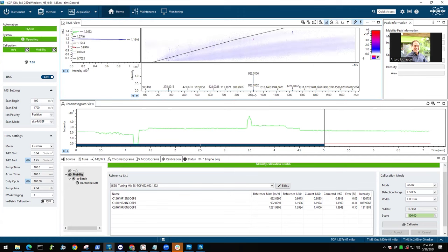With the ion mobility, it is fairly stable, but you see fluctuations based on weather conditions, for example. If you're coming from a high pressure system and you have a storm moving through, atmospheric pressure drops, you also see a drop in your ion mobility. So you have to change the valve positions a little bit to make sure that you're back in the range where you want to be. But it is not that it's completely drifting away. It's minor changes. But that as well, I would see it on a regular basis whenever you start.